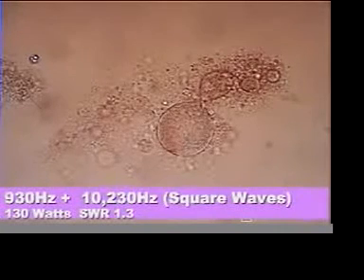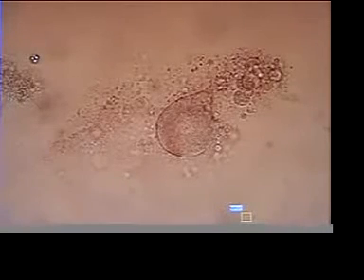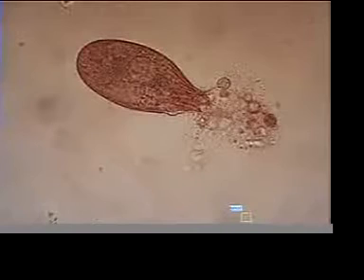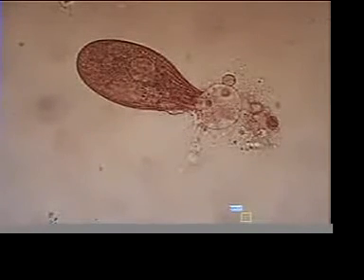And now we're going to stay with it and see if they fuse. There they go. Broke into spheres, and then the spheres sometimes fuse. Now I see the sphere formation. I don't have my scale right now. Great picture.